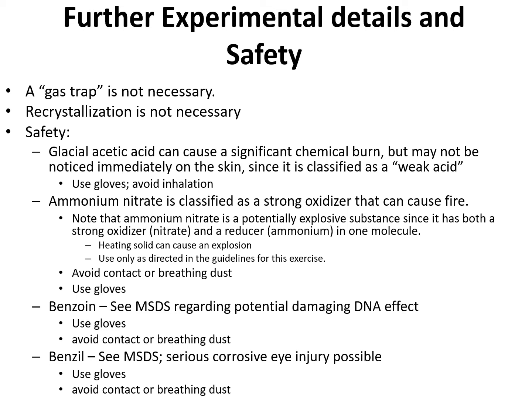And finally, safety issues regarding this experiment: acetic acid, even if it is a weak acid, can cause significant chemical burns to our skin and should be handled with great care. The best way to be safe from this is to wear gloves at all times in the lab.